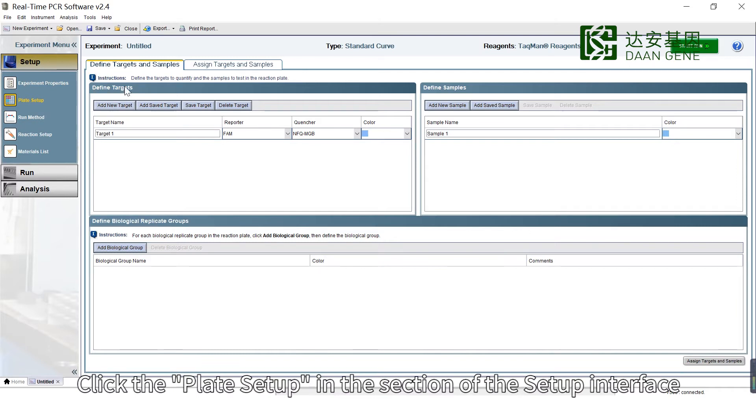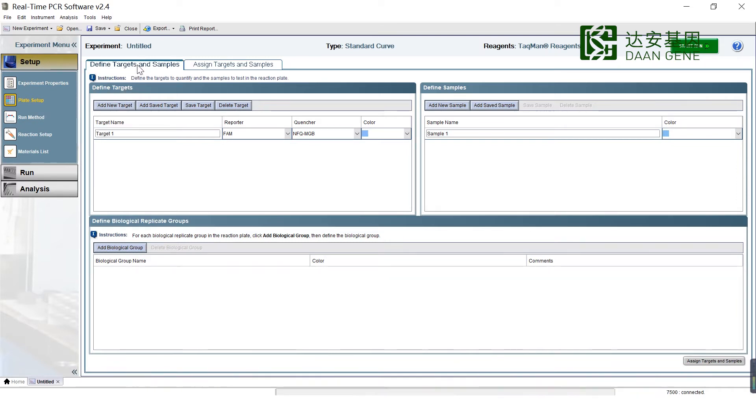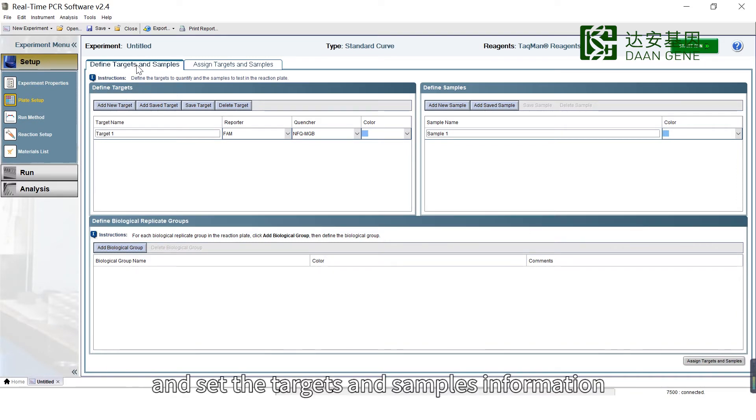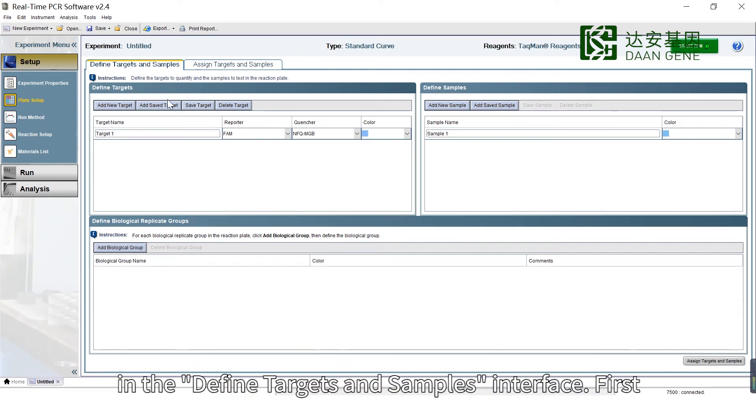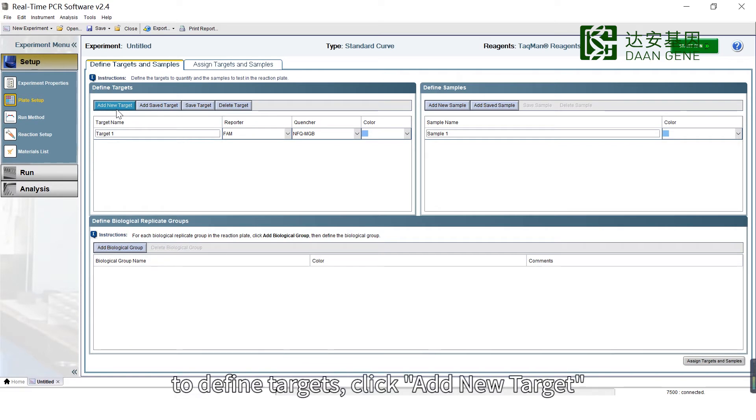Click Plate Setup in the Setup Interface section and set the Targets and Samples information in the Define Targets and Samples interface. To define targets, click Add New Target.